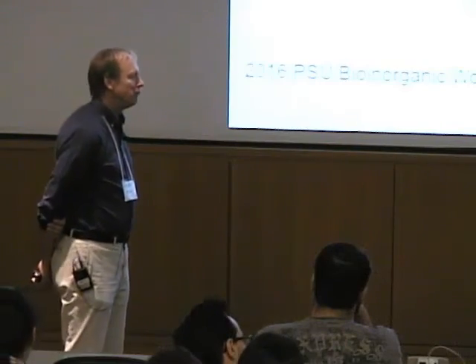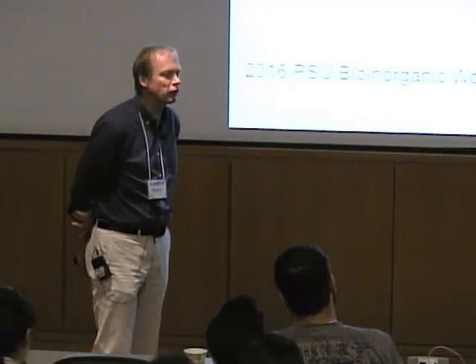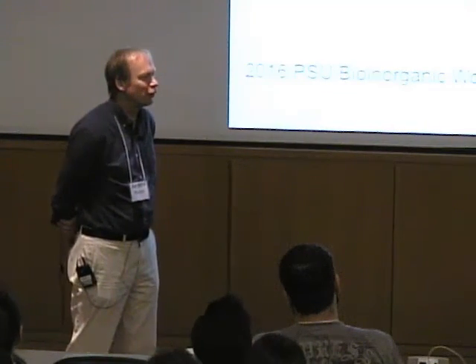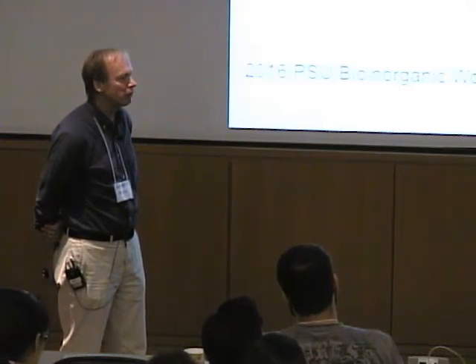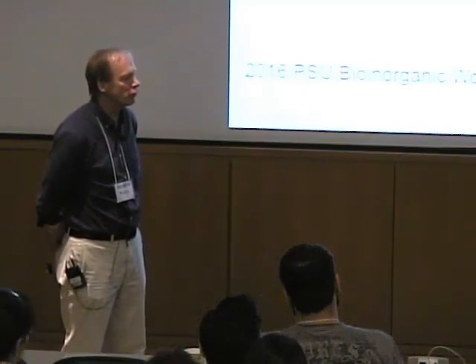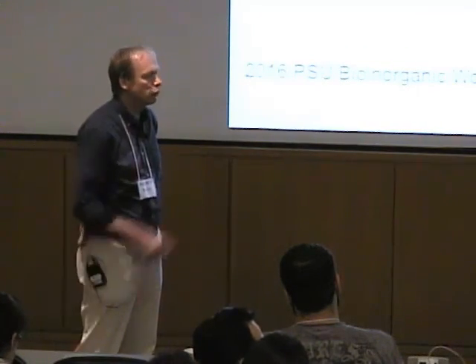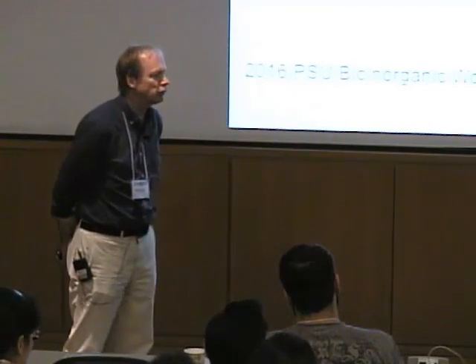I wouldn't completely discount that, but I'm certainly not aware of any real potential game changer. I mean, the big development, of course, now getting on sort of 25 years ago, was the introduction of pulse techniques, and you can measure the EPR spectrum using spin echoes to detect it, and in some cases that can have distinct advantages over using field modulation detection, but this still remains the main way that it's done, and I don't think we're likely to see that change in the near future.